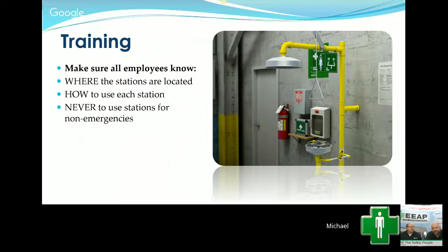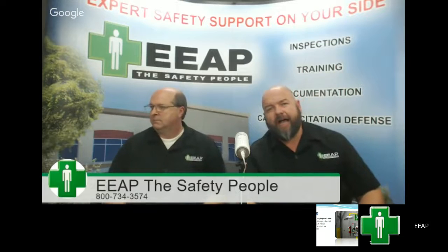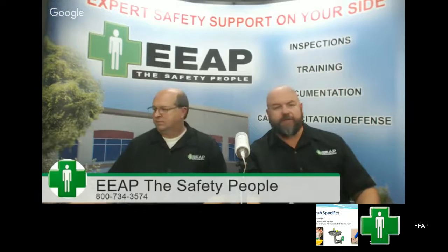Yes, Rick. And the thing really needs to be kept in order so that it's ready to be used when it's needed. I've seen a lot of things. I've seen people get drinks out of them, Rick. I've seen people use them as just a cooling off period where they can just go and get wet as they're working outside. They're really meant to be used for emergencies, and in doing so, you'll keep them better suited. They won't get broken so much. Hangers for jackets are just absolutely nuts. You got to stop putting your clothes on these things. I cannot tell you how many people we see hanging their clothes on these things or trying to get water out of it to drink or whatnot. Just keep them clean, and you'll find yourself that really is where you're at.